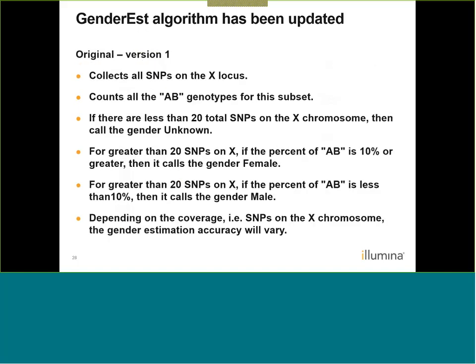All right? Now, there is a new version of GenderEst, and so there are two versions available. You can choose which one you wish to use.